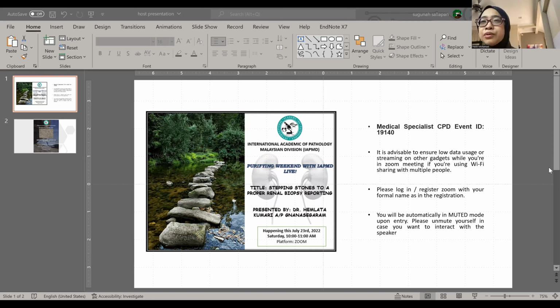Okay, Hema, we have a few more questions. Aznim Hani Ramlan is asking whether we could put eosin during the grossing of renal biopsy, like dropping a bit of color onto your biopsies so people don't over trim. Yes, the answer is yes. The tissue is see-through, so we definitely put eosin to identify the tissue. It should not affect your tissue biopsy. There should not be a problem. Yes, you can do that.